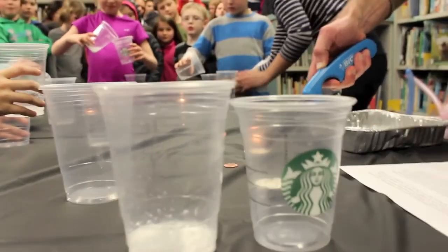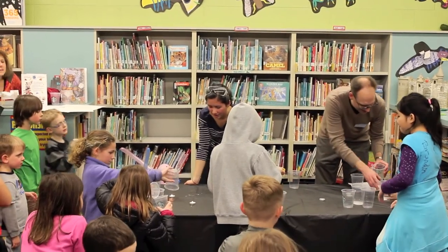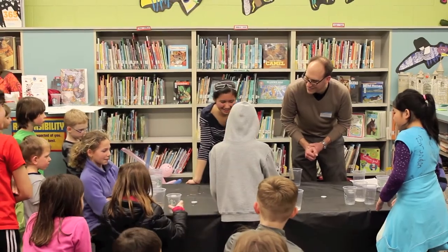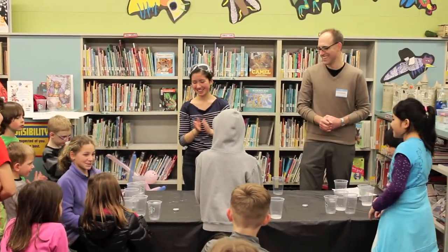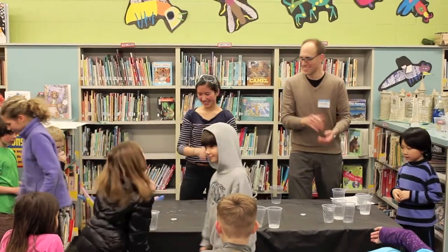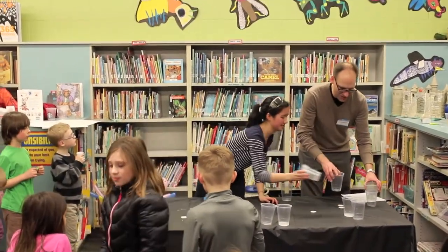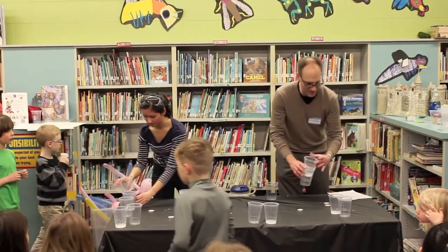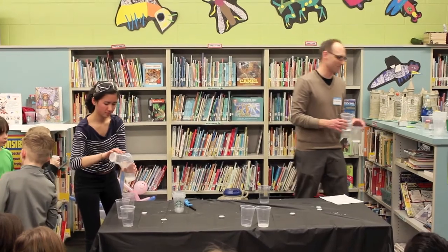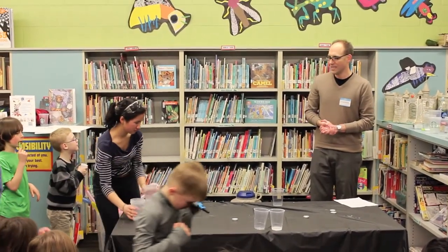Whoa! The gas is... Five for five there. Good job. All right, excellent job, everybody. That was a volunteer. So we just used a solid and liquid, combined them to form a gas, and then used that gas to put out a fire. Pretty cool.